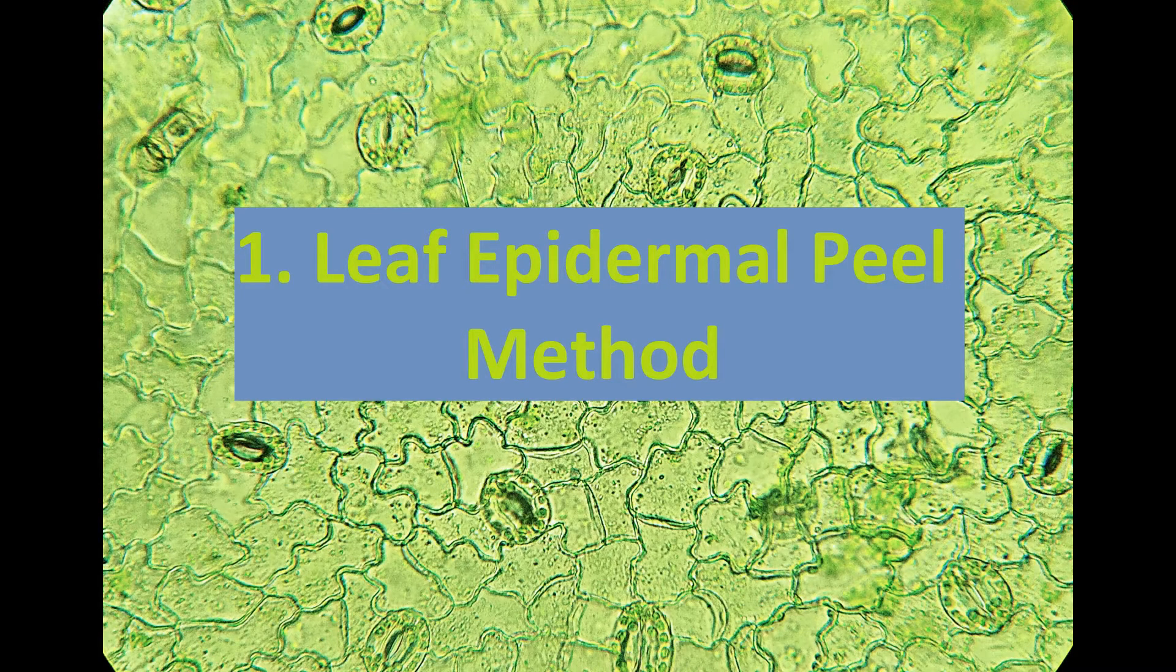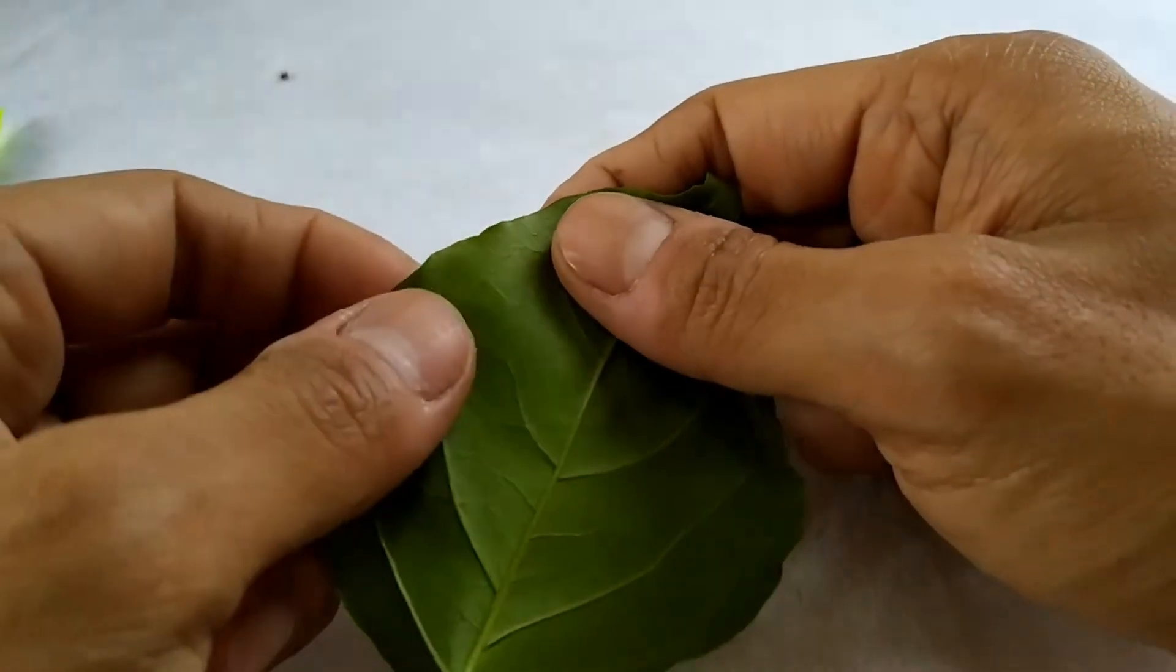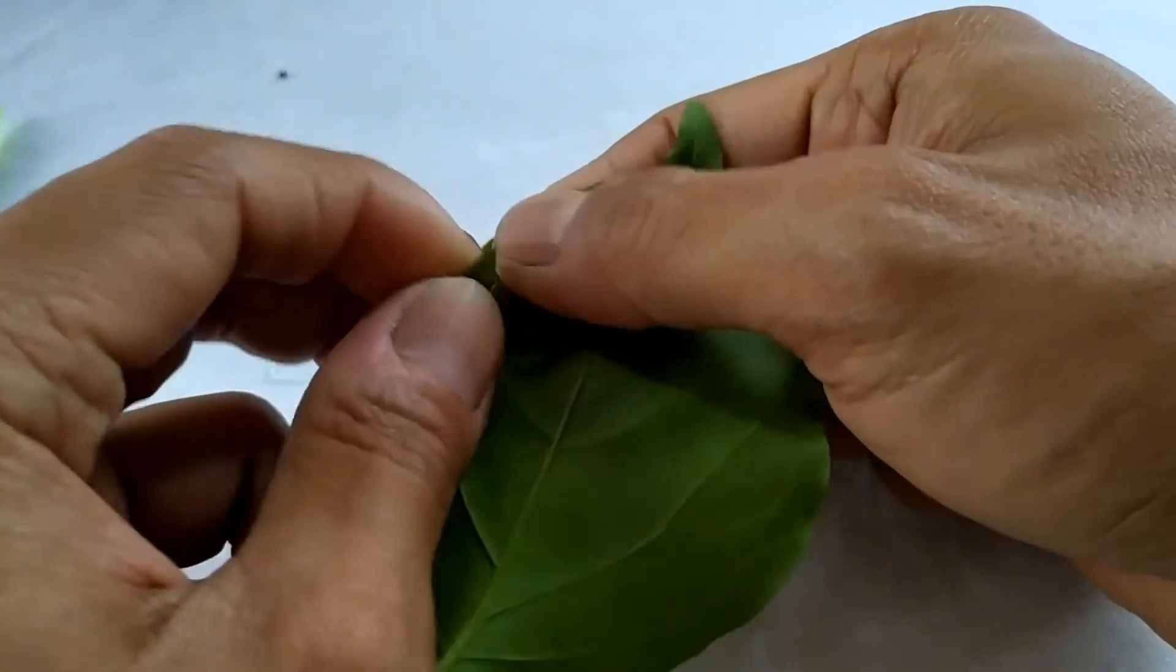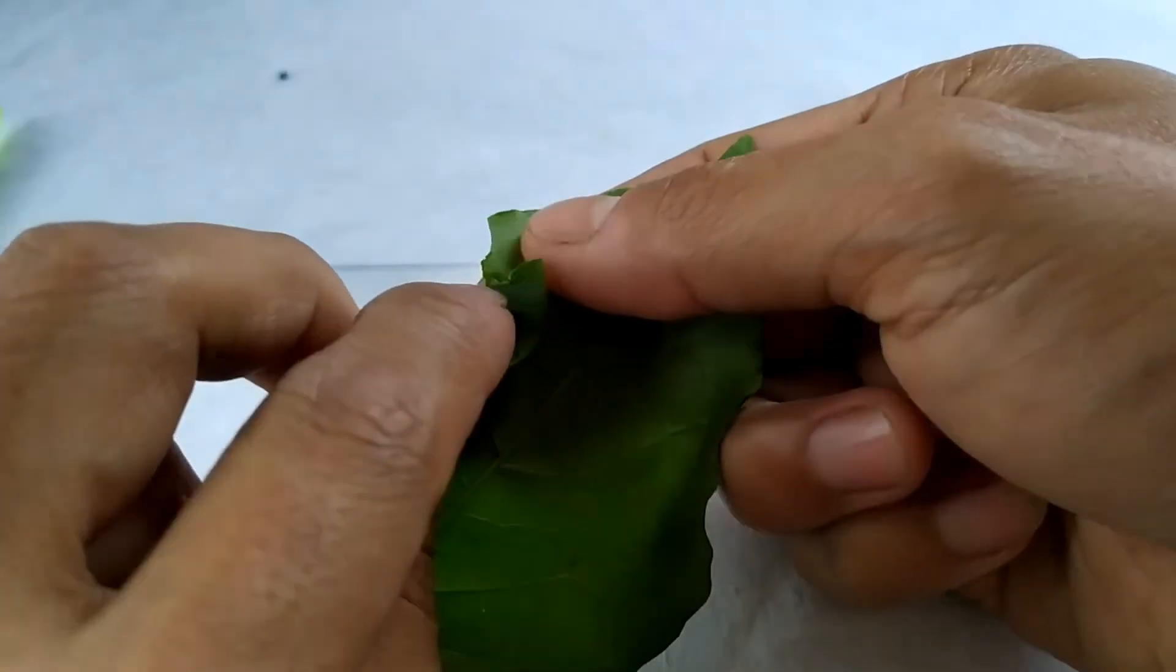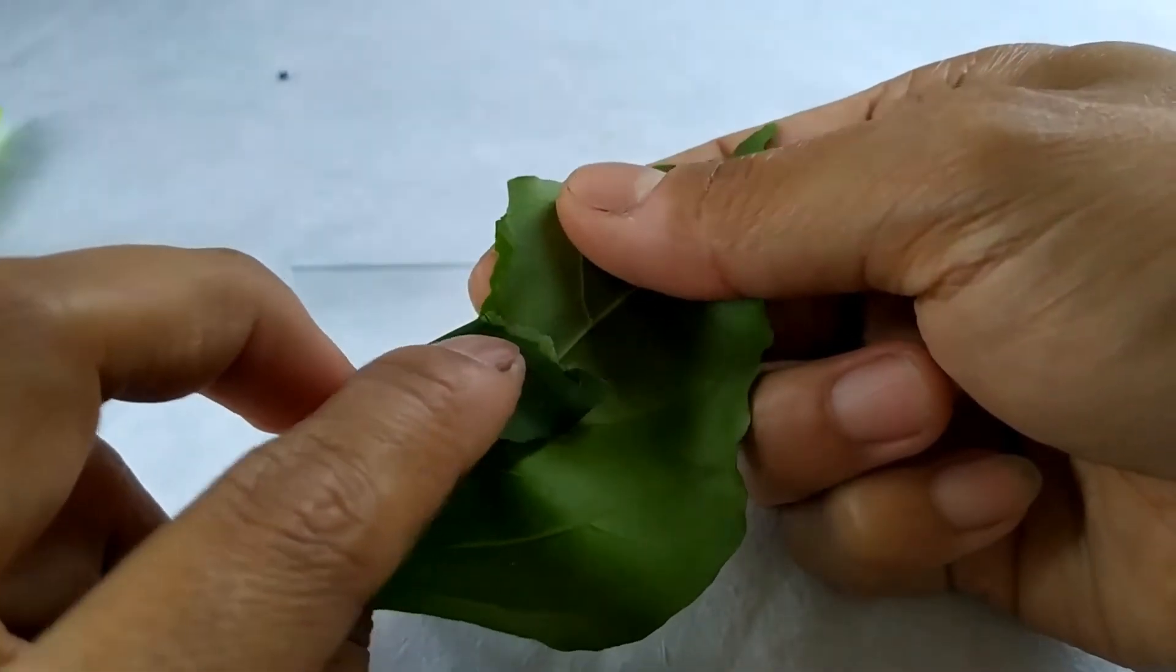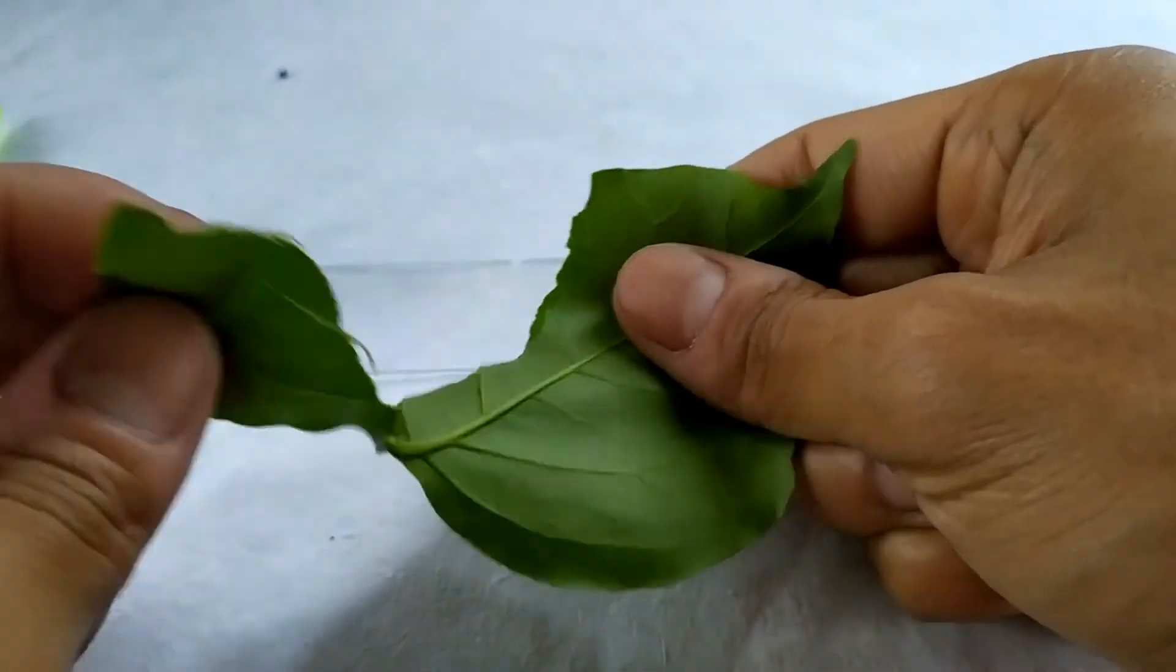For the leaf peel method, we begin the experiment by taking a fresh green leaf. Hold the leaf in one hand with the lower surface facing up. Partially break the leaf by folding it and gently pull a segment of the leaf blade towards you.